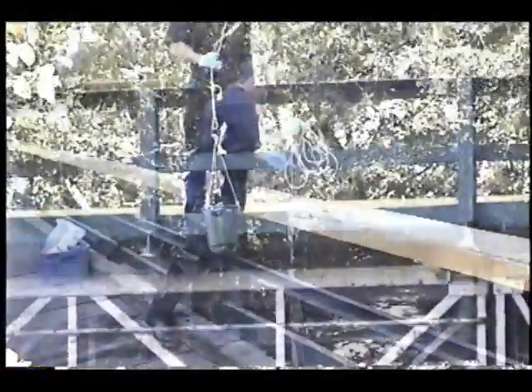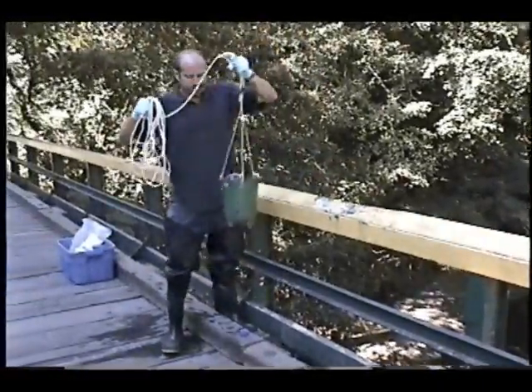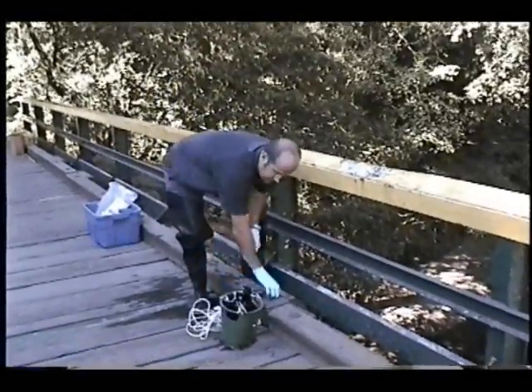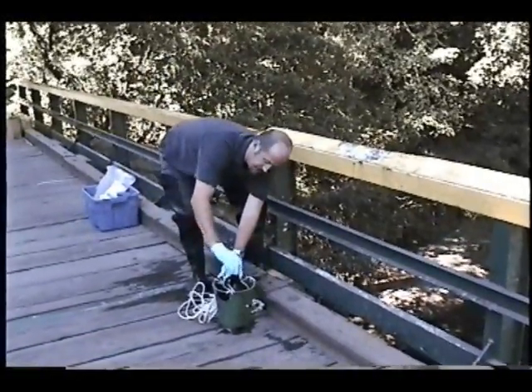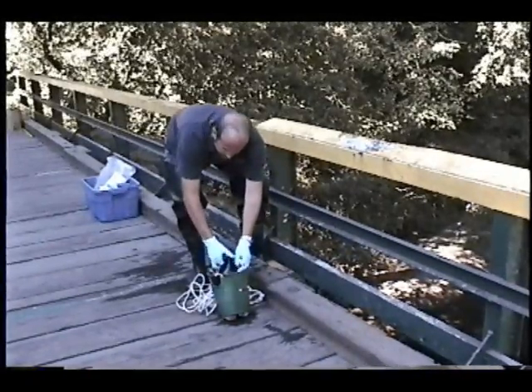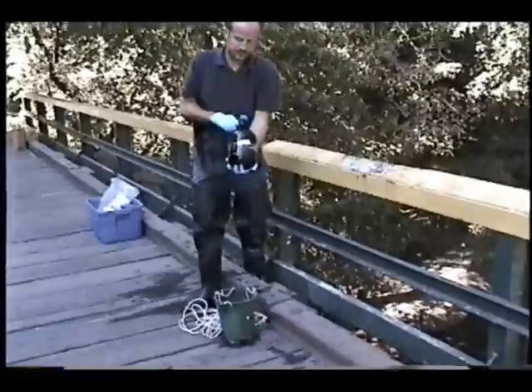After the bottle has been rinsed three times, we then fill the bottle completely to the top. We'll cap the bottle. The water sample is complete.